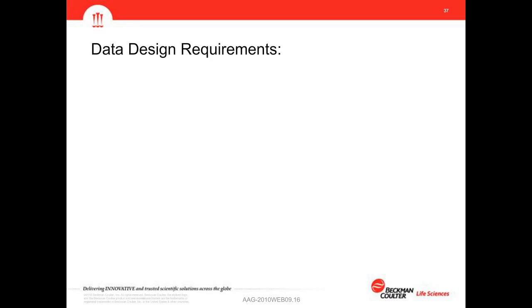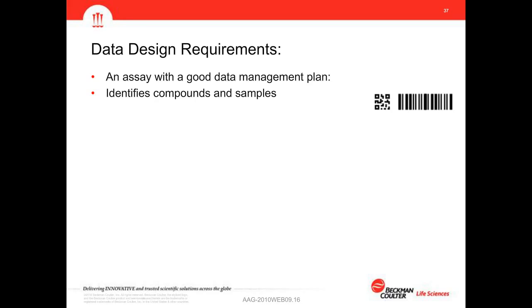To begin wrapping up here, if we look at good data design requirements, well, our discussion today really has been about looking at our three different levels of information with our run, our labware, and our well data. We looked at the Sammy EX, the DART, and Sammy process management data manipulation tools, and then we finally looked at our data workflow with importing, processing, and analyzing data. So as you're looking to build a system, a good data management plan needs to do a few things. And this is valuable information when you're looking to plan out how to use data in a laboratory setting.